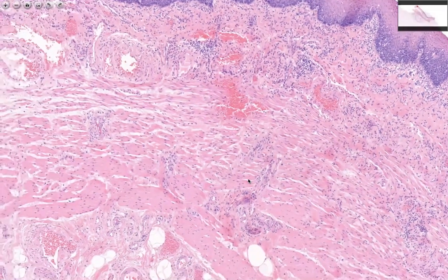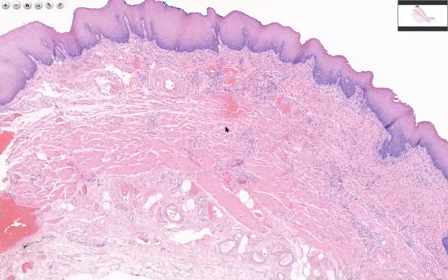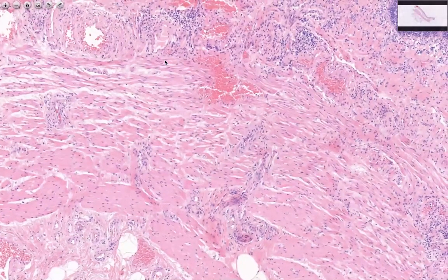And in the esophagus, the muscularis mucosa is somewhat interesting in that whenever there are reactive processes going on, it tends to get very thickened or duplicate. And so here you can see that the smooth muscle layer of the muscularis mucosa, which are these thin pink sort of linear structures going across the screen this way, actually spans from all the way up here to all the way down here.